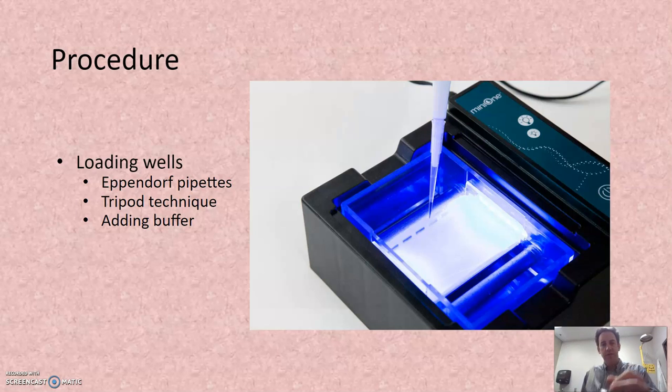Then what you're going to do is pour buffer solution into it. The buffer basically helps DNA fragments migrate through. It helps the electric current go through. So note that the sample is sitting in the middle here, and then there's a depression down here and a depression down there. And so you're going to pour buffer into both sides until they're both almost to the top of the gel. And then you're going to slowly pour a little bit more over to sort of cover it up. Okay.